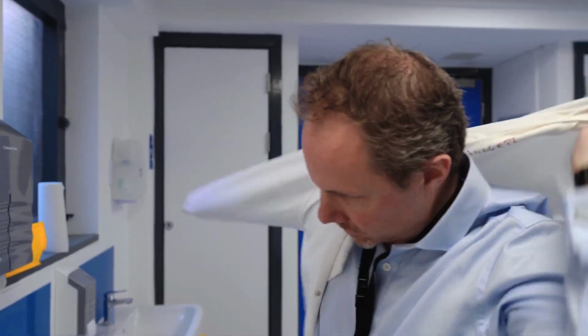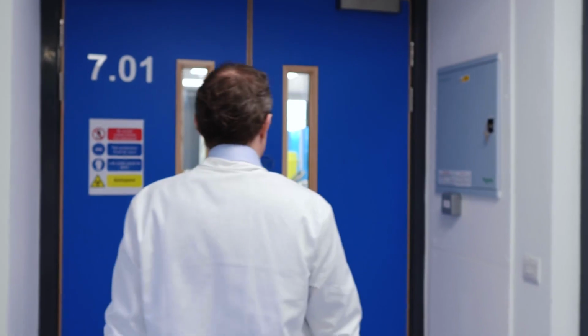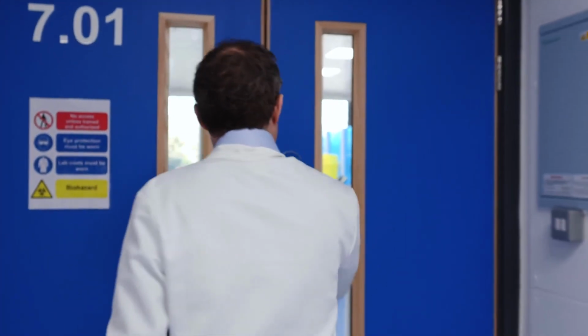One of the big challenges for standardization using molecular methods is that of quantification. Molecular methods are used quite often for presence or absence. You can think of sexually transmitted infections as an example, or even genomic testing or genotyping of patients. But where you're trying to quantify the presence of something, it becomes much more challenging.